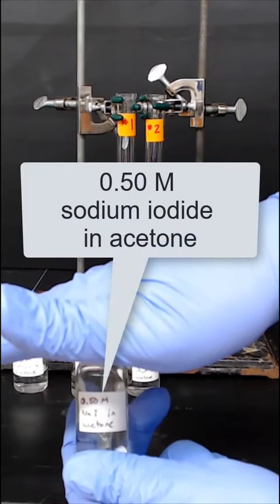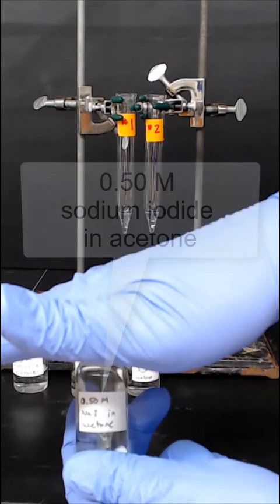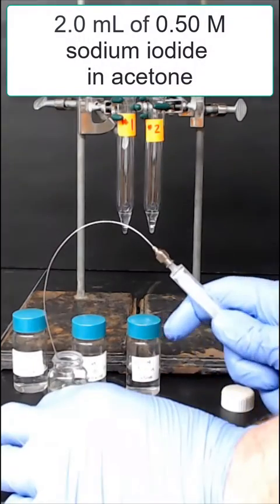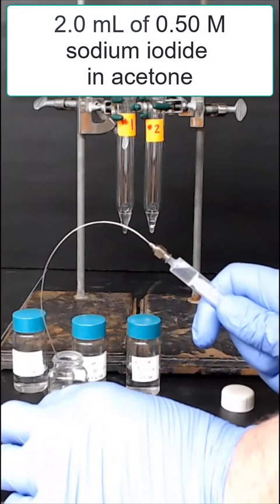Next, we'll add a 0.5-molar solution of the nucleophile sodium iodide in acetone. We're going to add two milliliters of this solution to each one of the reactions.